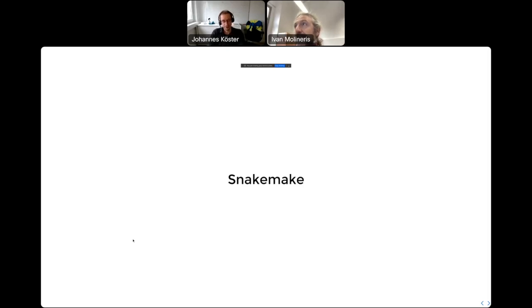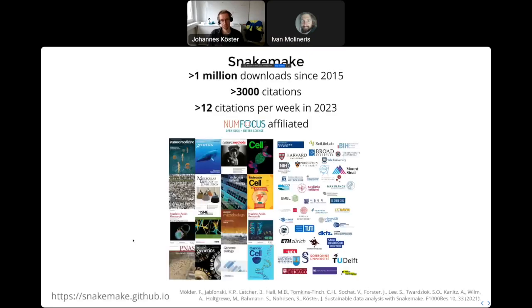So this seminar is a bit different to what I usually present about Snakemake, because it's not so much regarding the basics, but we are really focusing on a couple of special aspects about Snakemake that are more towards the end of the data analysis. Nevertheless, just to set the stage, I want to give a brief 3-slide introduction into Snakemake in general, just to make sure that everybody is on the same page about it.